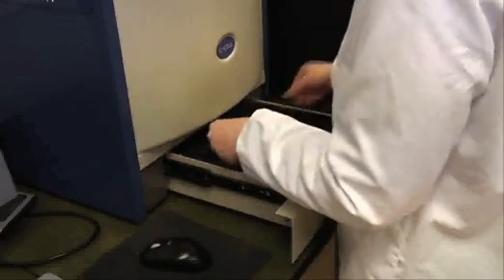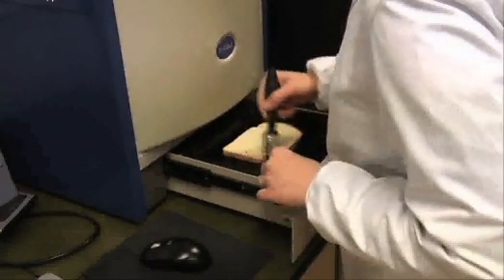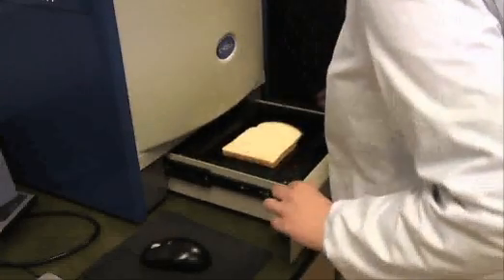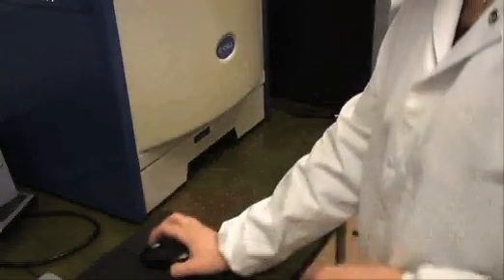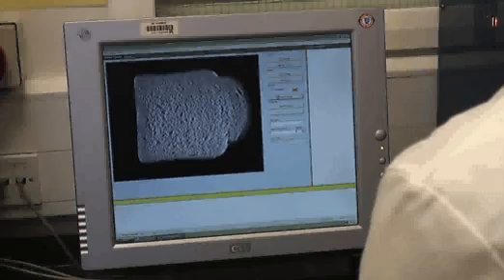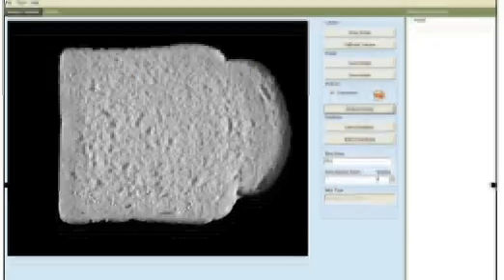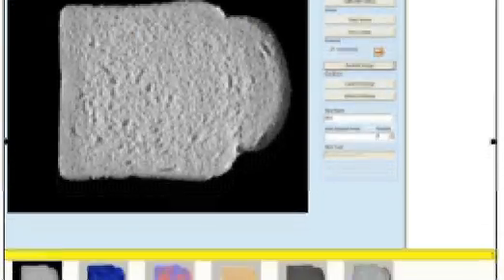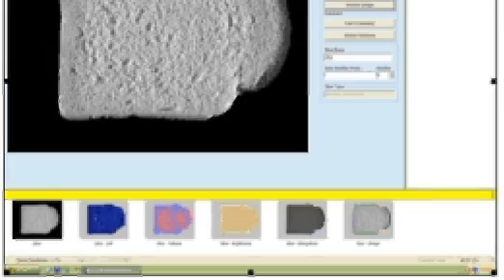The C-cell cabinet allows the bread to be placed in a drawer which is then illuminated and an image taken. This image is then analysed, and that analysis allows us to use very clear objective characteristics related to the cell structure and the overall shape of that individual slice of bread.